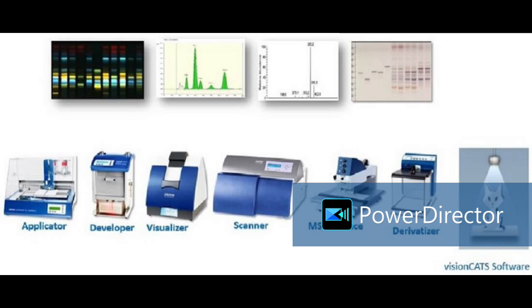We have already added absorption spectra of many drugs and many components in our library. If we develop the plate and take an unknown spectrum and match it with the library, you can see the name of that component, the possible name. It will be caffeine or theophylline; of the first 4, 3 are caffeine, and the first hit is caffeine, the correlation is 0.99 and the position is 0.62 RF value.